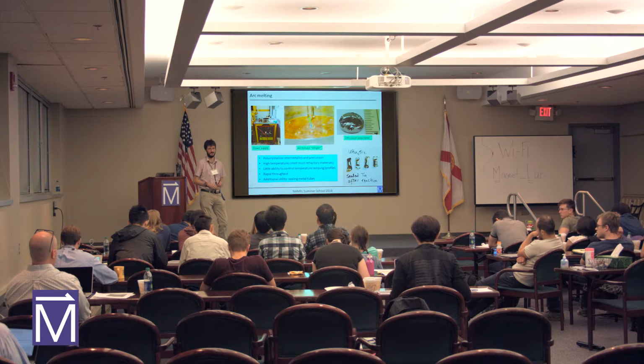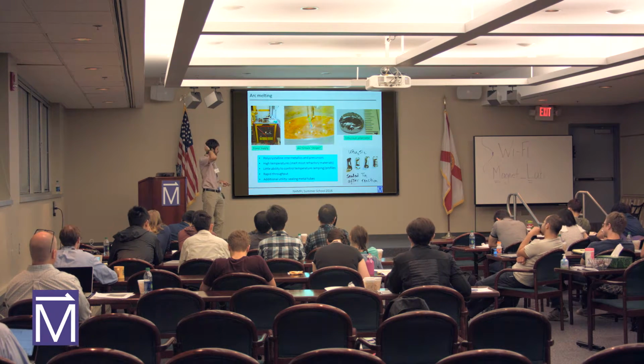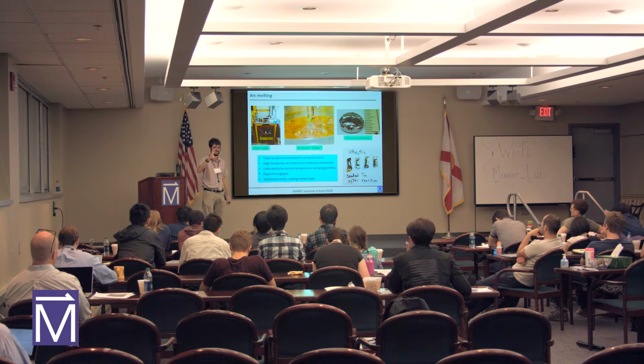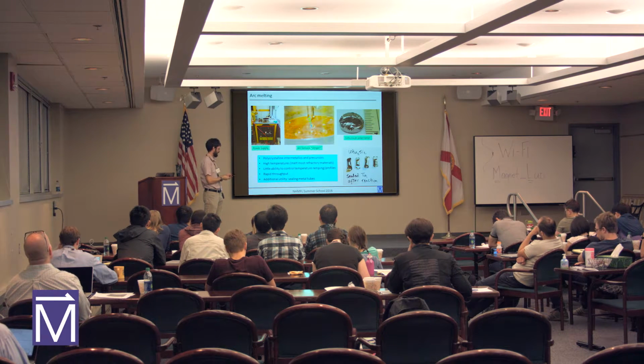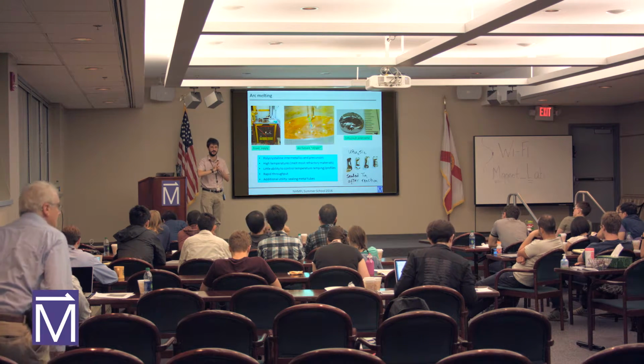Yeah. How do you fill the materials with a half-wafer barrier? It's tricky. So it takes some experience. What we do, and I'll just tell you, is we start off with the tantalum tube. So imagine you just have the tantalum tube. We cut out a section of it like this, and then we press the end of it. And I like to have a fairly significant length pressed. So this here is probably about half of what I started with, right? So I hard pressed a good long length of it.